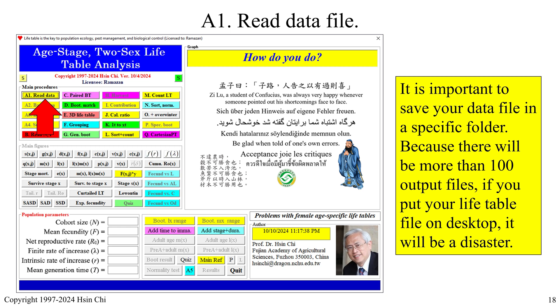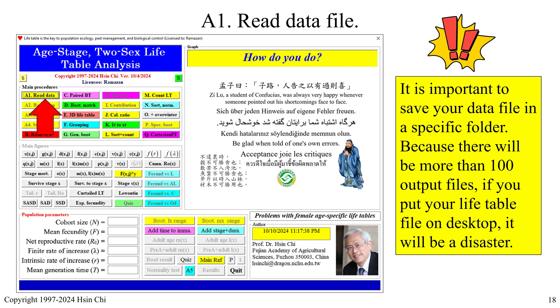First of all, you should click on the A1 Read Data File button. It is important to save your data file in a specific folder, because there will be more than 100 output files. If you put your life table file on the desktop, it will be a disaster.